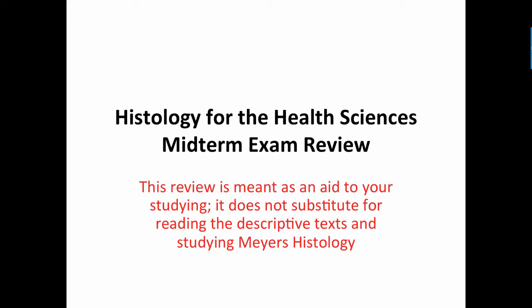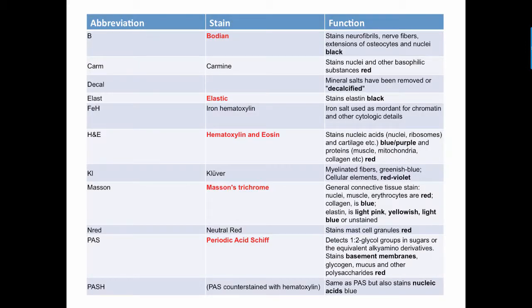I'm actually going to do it in little segments so that you can watch a segment for about 5 to 10 minutes and not have to watch the whole thing in order to get to something like skin. So we're going to start with staining, which is the first topic of any consequence in this course.